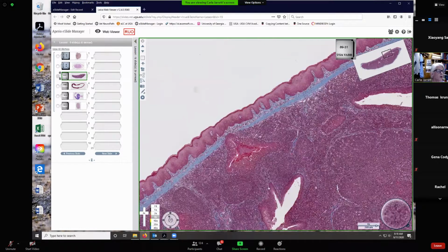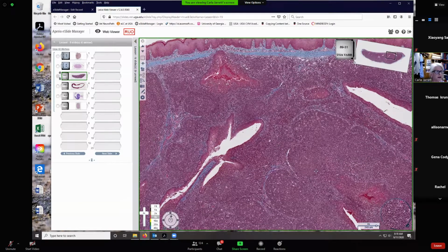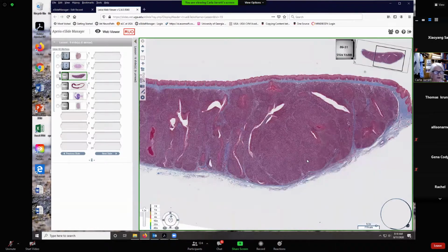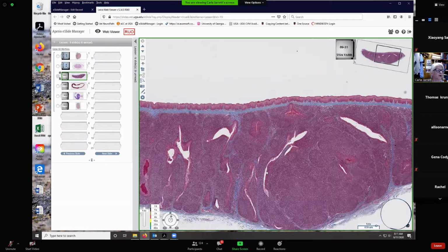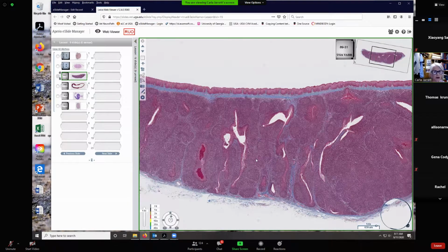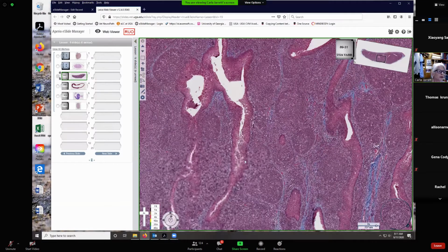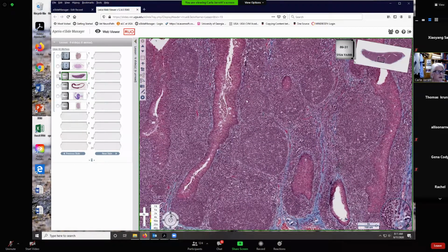Now, what did we learn about the organization of the lymphocytes in secondary lymphoid organs? This is definitely a secondary lymphoid organ. We learned that the organization of the lymphocytes was nodular and diffuse. And the nodules were what lymphocytes? They were B cells. So here's a B cell nodule, here's a nodule, there's a nodule, everywhere's a nodule, okay?